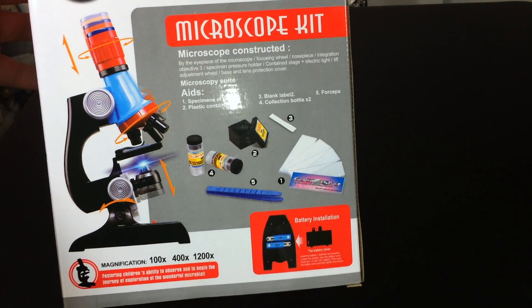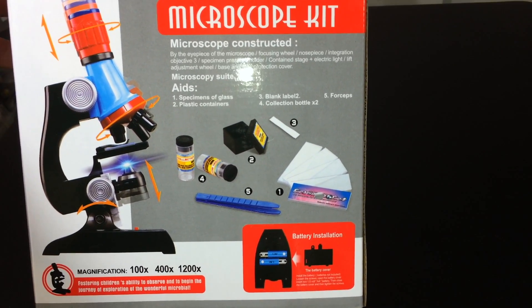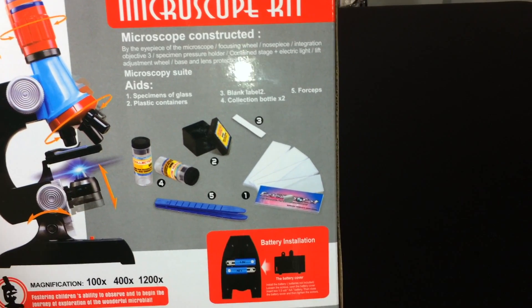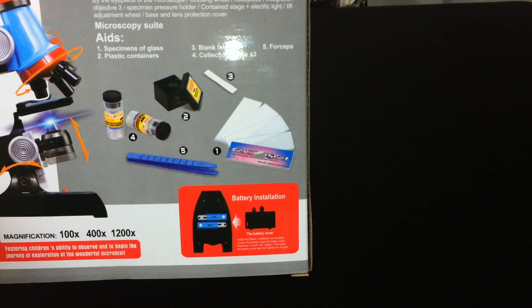So we could tell right here the couple samples that it comes with. It comes with a couple of tubes. I guess you could put your specimen in there. Looks like labels right there are number two. Has some stickers, has some tweezers, and a couple slides right here.